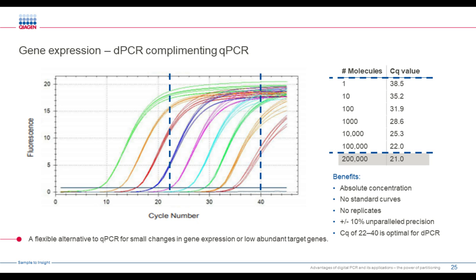So when you start a new project with gene expression, my suggestion to you is that you run your 2 conditions on a qPCR first with only your reference gene, because then you can pick the one that is in the Goldilocks zone for the reference gene, if you will, somewhere I would say between 25 to 30.